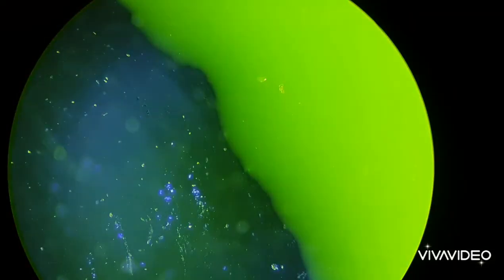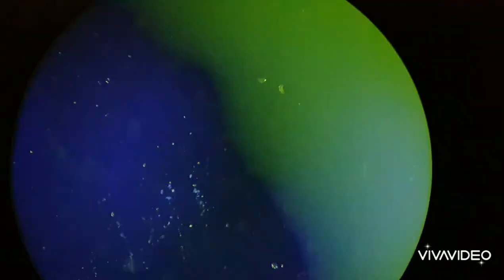In this footage you can definitely see the carbon dioxide. It's really cool. It confirms that this is how the reaction works.